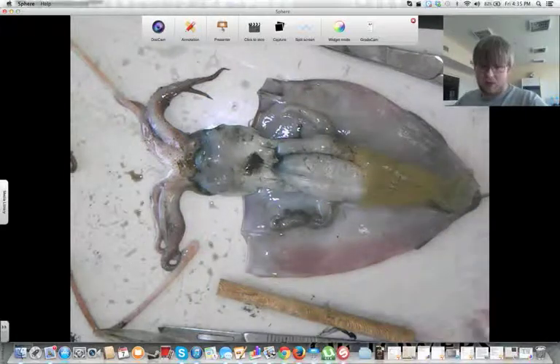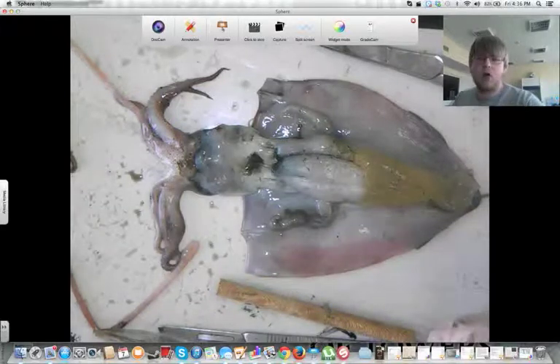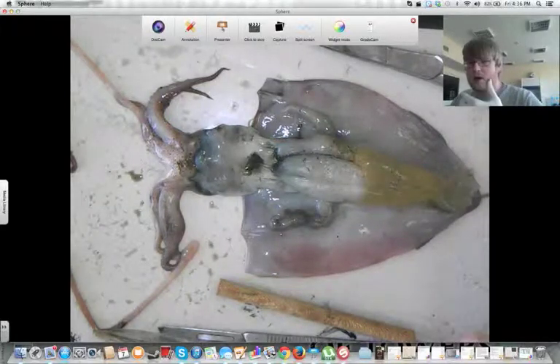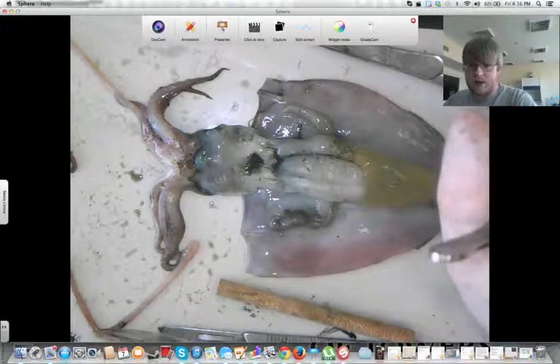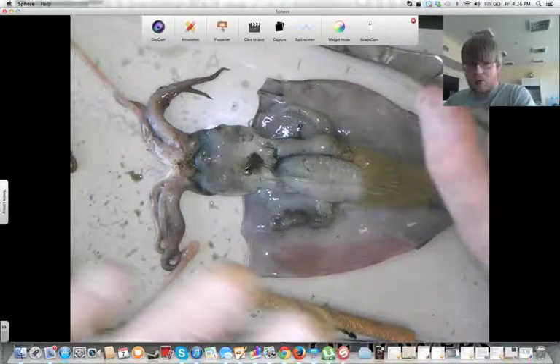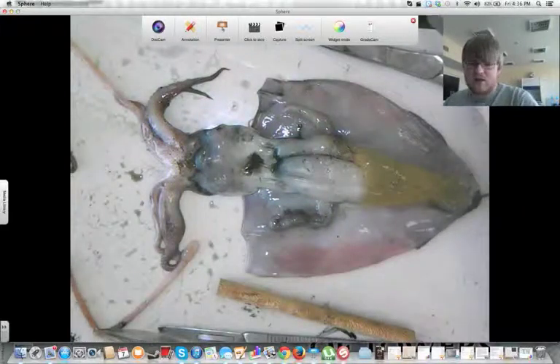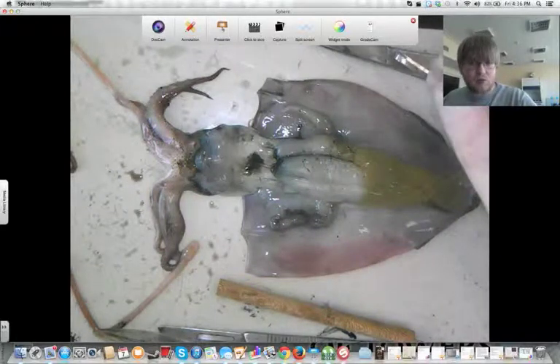Biological drawings should be large and easy to see, but they don't need to be extremely detailed. They do, however, have to have the proper shape. You have to be able to see everything is clearly the organ that it's supposed to be, because we need clarity. You don't need to show all of the different shades and colors that you see here, but you do need to show the shapes accurately. So take your time.